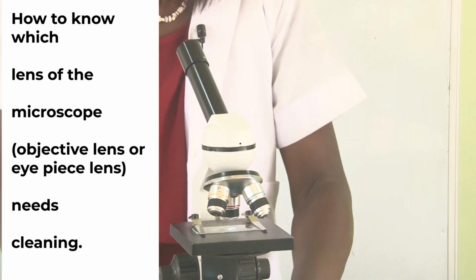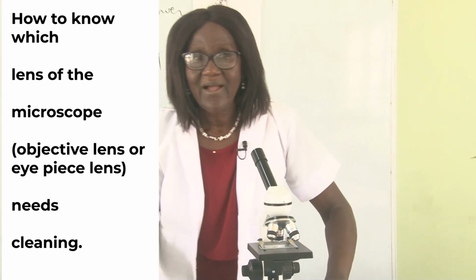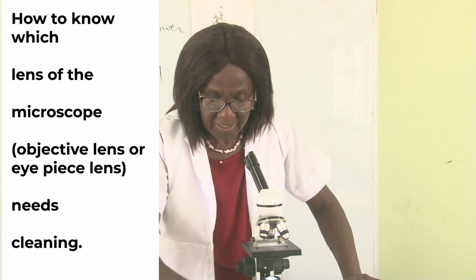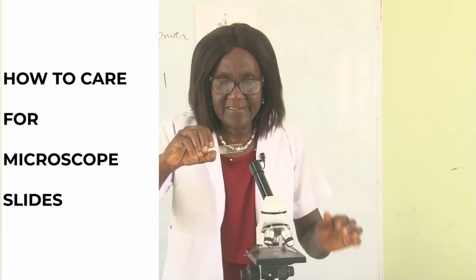Good. Now we want to shift on to another care. We want to shift on to how to care for microscope slides.